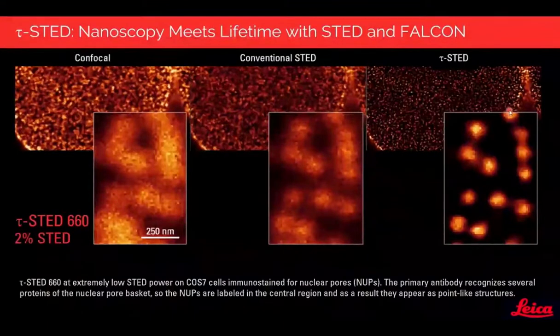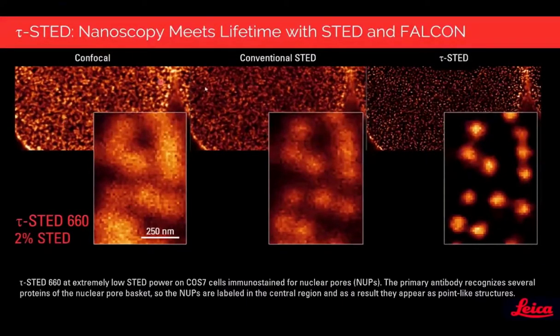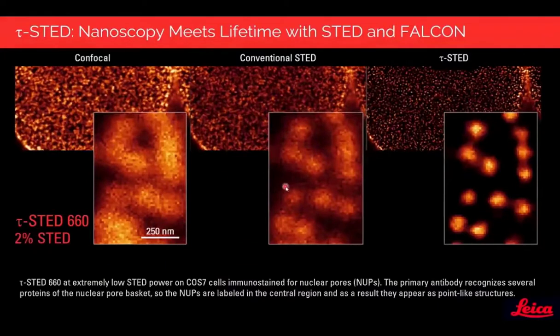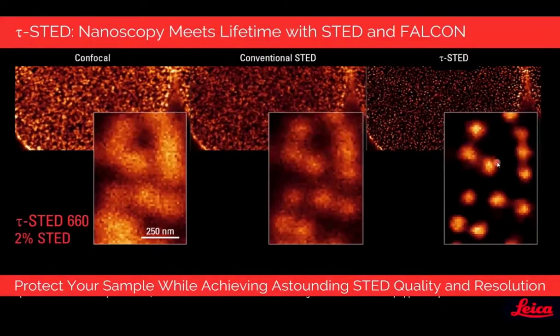Here is an example illustrating the strength of TauSTED. We have nuclear pores stained at the basket, appearing as tiny dots. We image them in confocal and also in STED with very, very low light dose — just 2% of our 660 nm STED line. Comparing confocal with conventional STED, we don't see much of a benefit. But with TauSTED, protecting the sample at really low STED light, we can achieve outstanding STED quality and resolution.